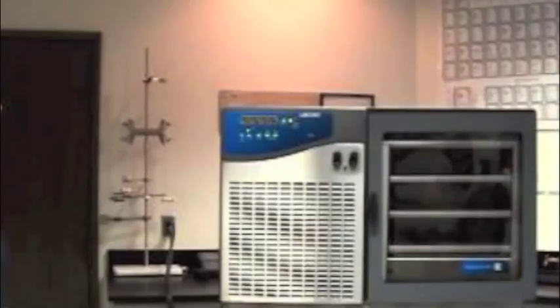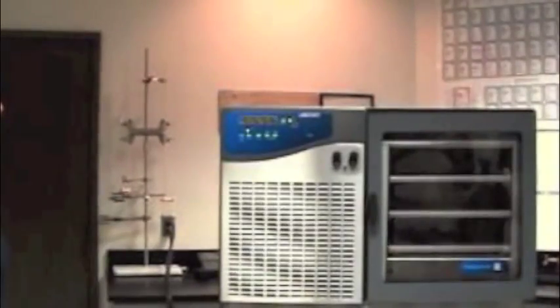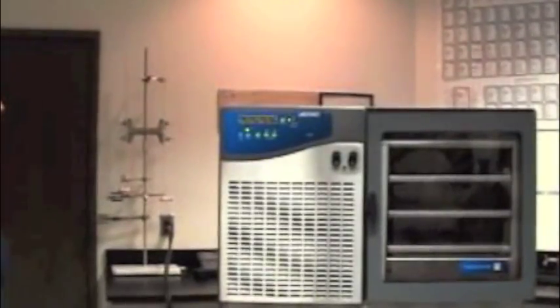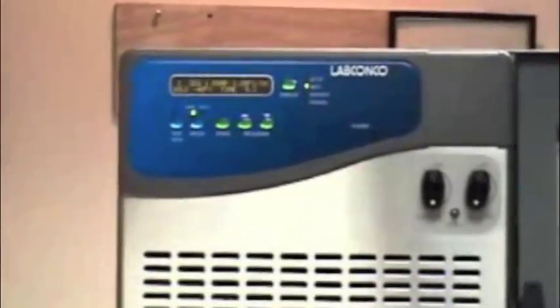The stoppering tray dryer has five user set programs, each with five segments. The first segment is always pre-freeze.